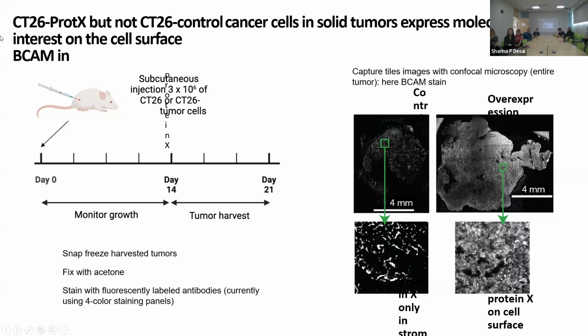I just want to give a very brief overview of the tumor model, what we're actually seeing here. It's a simple subcutaneous tumor model. You have mice, you inject tumor cells into the mice, then the tumors grow. And in this case, I'm comparing 2 different types of tumors. I'm not revealing the name of the protein here because it's funded by a company, and I'm not supposed to talk about it and it's recorded, so I'm just pulling it out, but it's not important here anyway.